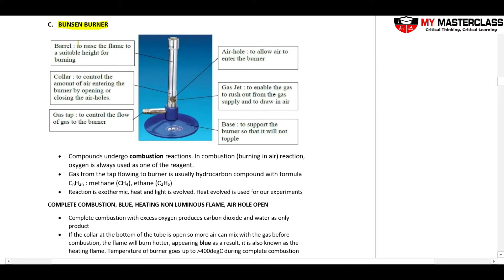The first apparatus we are going to use is the Bunsen burner. The different parts: we have the barrel, which is to raise the flame to a suitable height, so essentially the flame will be at this area. We have a collar that I can turn, and when I turn it, there will be a hole here called the air hole, which will open or close when I turn the collar. This collar essentially controls the amount of air — more accurately, the amount of oxygen — that enters for burning.